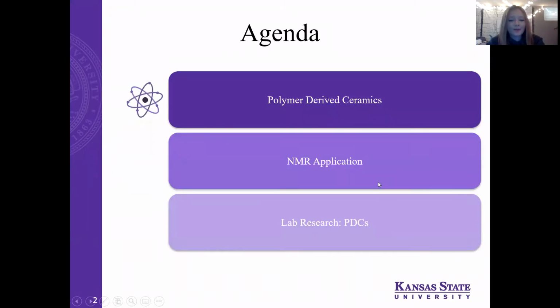So on today's agenda, I'll be talking about polymer-derived ceramics. I'll be talking about the NMR application for these polymer-derived ceramics. I'll be talking about my own lab research related to PDCs.